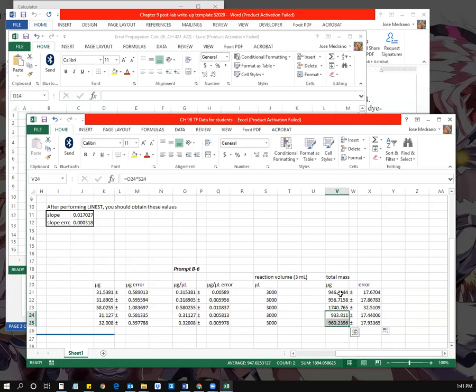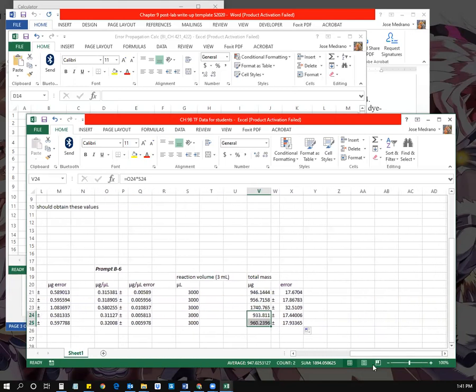If you remember how you set up your DTNB reactions, for reactions 3 through 7, you put in about 1 milligram of GAPDH protein. So these absorbance values are indicating how much protein there was in those DTNB reactions, and it reflects very well how much there was in our actual reactions in terms of dye binding activity.